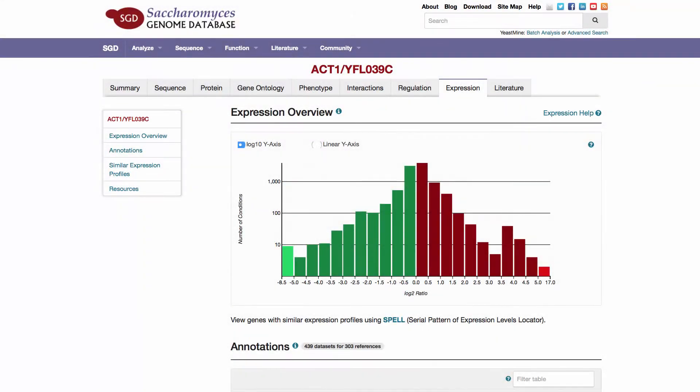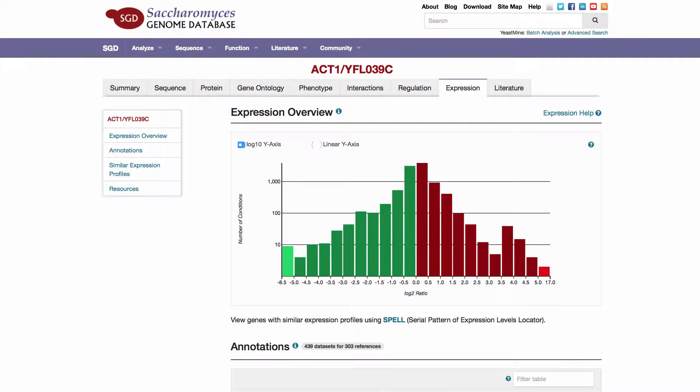Welcome to this quick tutorial on the expression page. In this video we will focus on the expression overview section.